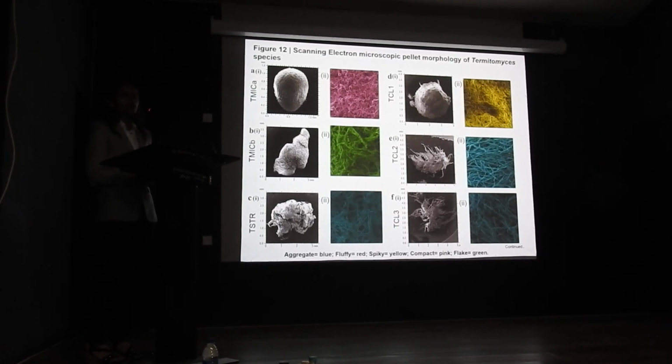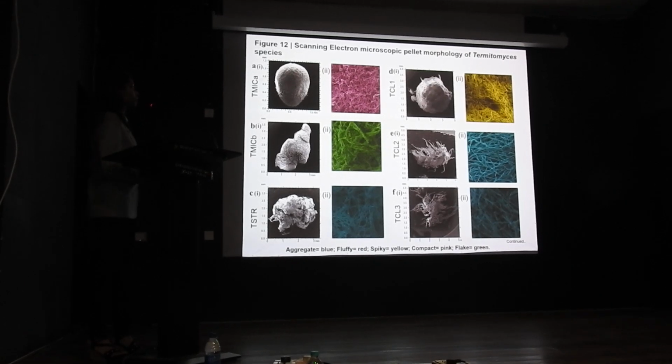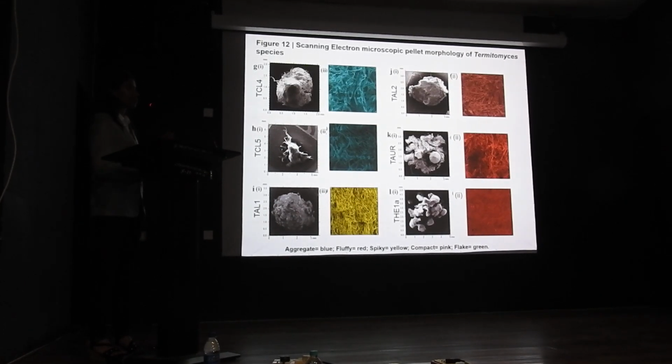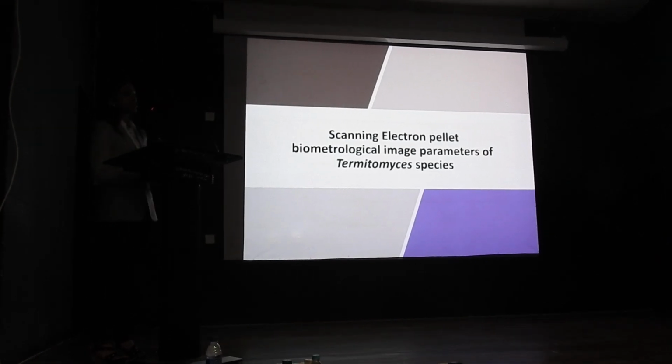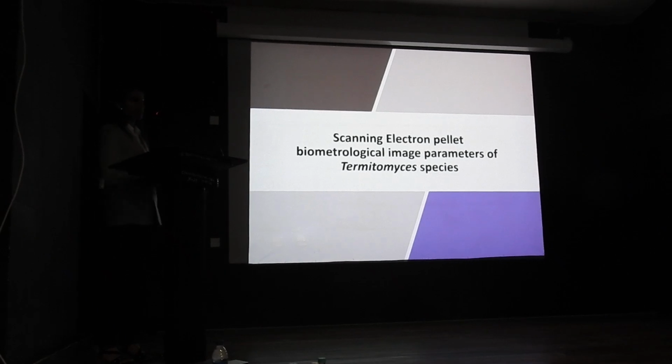So SEM studies were also done, because studies have not been done before on submerged pelletization. So these were also subjected to various SEM studies, and the biometrological parameters were analyzed to give the idea about what exactly each image says.